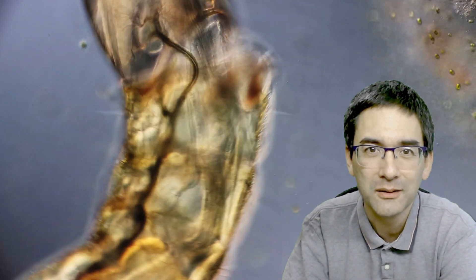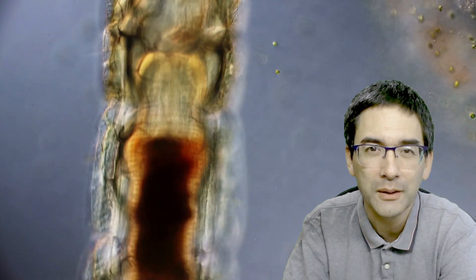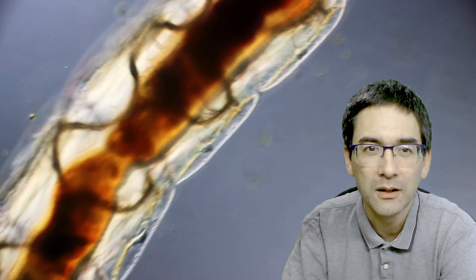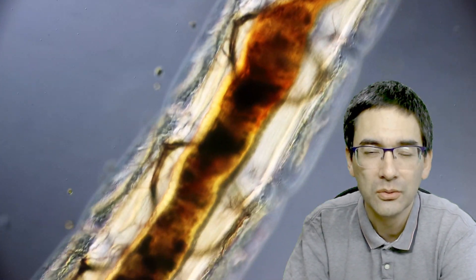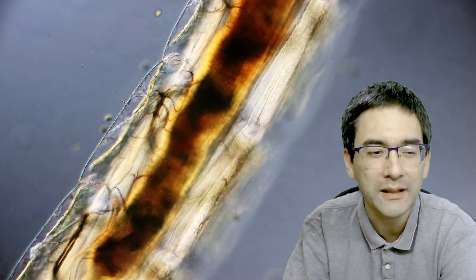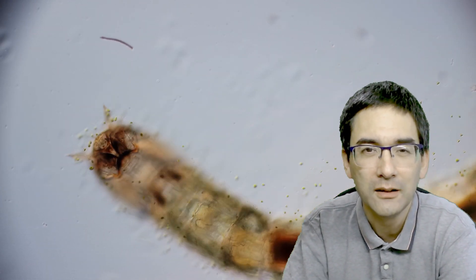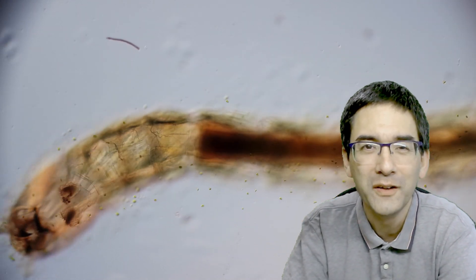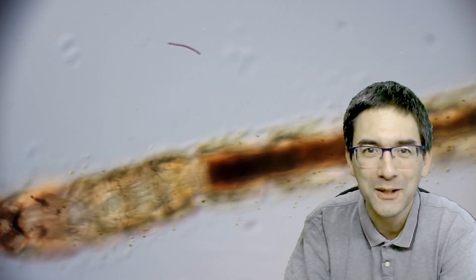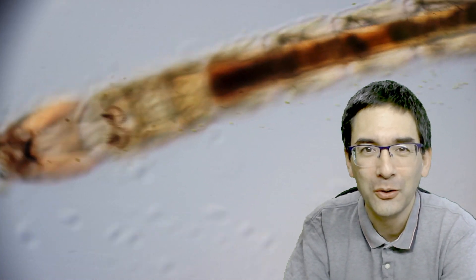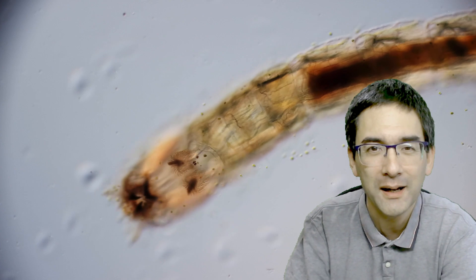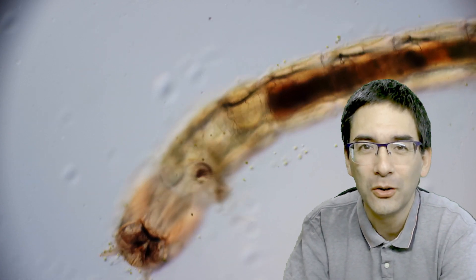Now when I looked at it, immediately I was able to see that there are blood vessels beneath the surface of the body, quite nicely visible here. As it kind of moved along, I was able to see also that there were tiny little feet, and here you can see it quite well. Those tiny little feet were moving along in unison, pushing the larva along on the smooth slide. Even on the back side towards the tail, there are also two other feet.